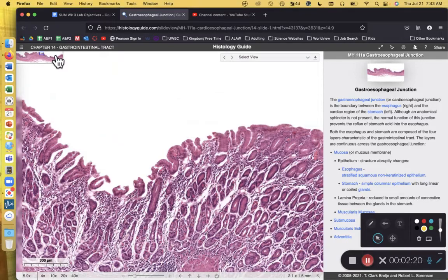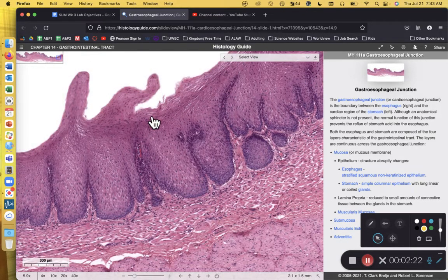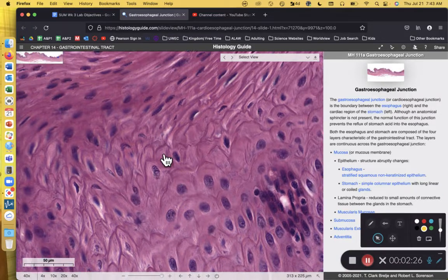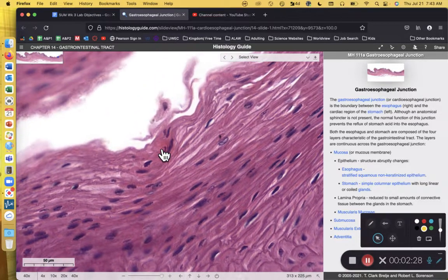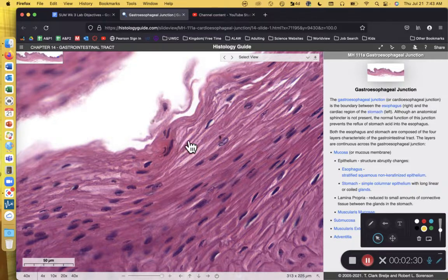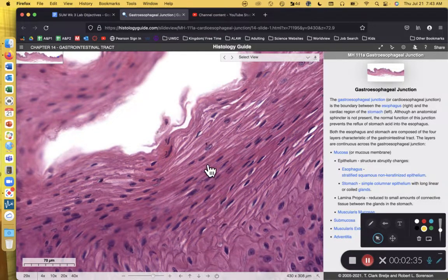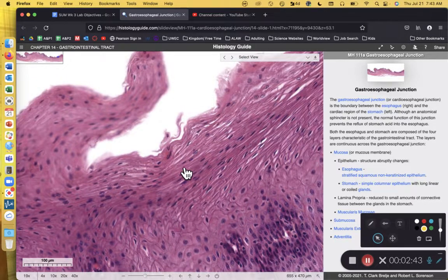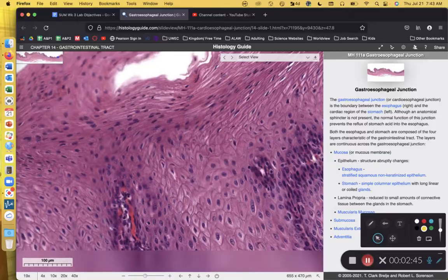And let's zoom out and focus on the esophagus. Over here is the esophagus, and the tissue of the esophagus is a stratified squamous epithelium. So we have many layers of flattened cells. As a reminder, when we talk about the tissues and we're in tissue morphology with the epithelial tissues, we focus on the surface layer or apical layer. So we have a stratified squamous epithelium right here.